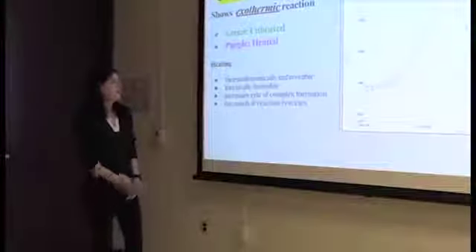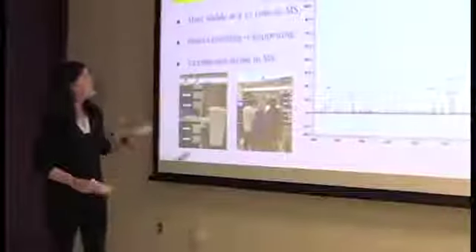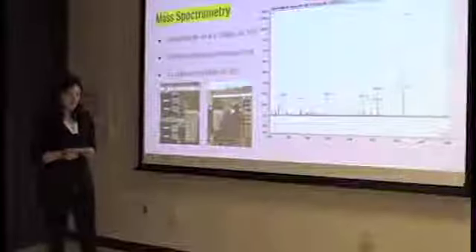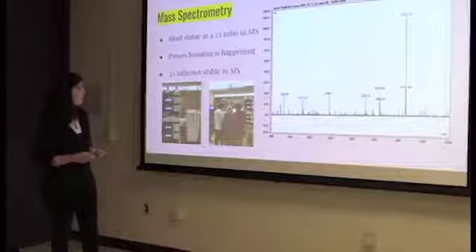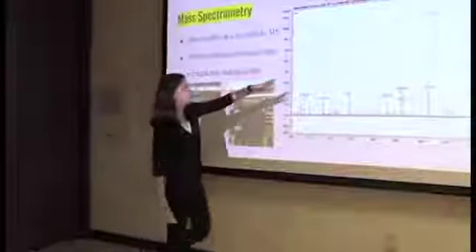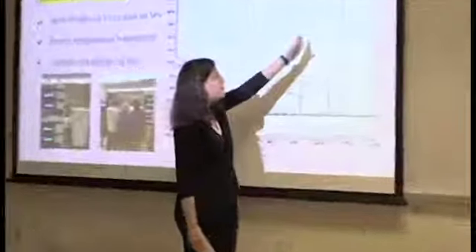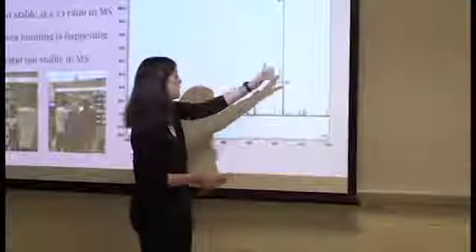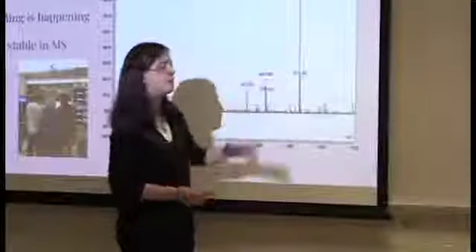Really bad. Okay, so next we're talking about mass spectroscopy. We went to the NJIT lab, and Dr. Yuang Zhang helped us, which was very helpful. We don't have an MS, and what this shows here, this number, 413, that's the average weight of all the curcuminoids plus 1 iron. This is curcumin here, that's the complex.